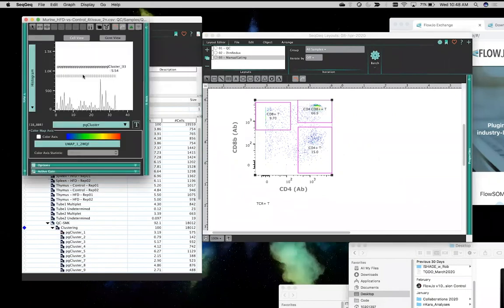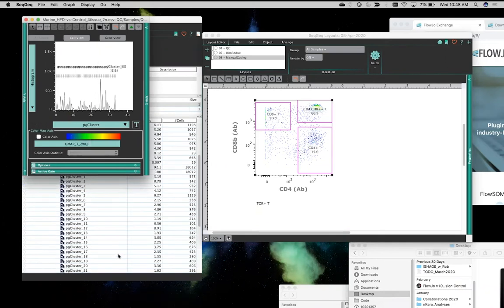Okay, we got a lot of clusters from Phenograph. This is a little bit more than I was expecting, but it's okay. We can handle a large number of clusters if we want to. We could also choose to go back and rerun this with a higher K. Already 100 is pretty large, so I wouldn't necessarily want to do that now. Also notice the larger you set your K value, your K nearest neighbor's number in Phenograph, the longer it's going to take to calculate. So just bear that in mind as you're starting to set your K very, very high, although it will give you larger clusters, a smaller number of large clusters as opposed to a lot of very small clusters as we see here.